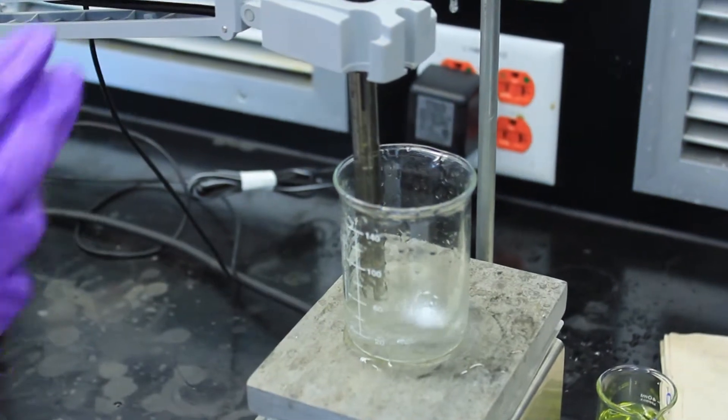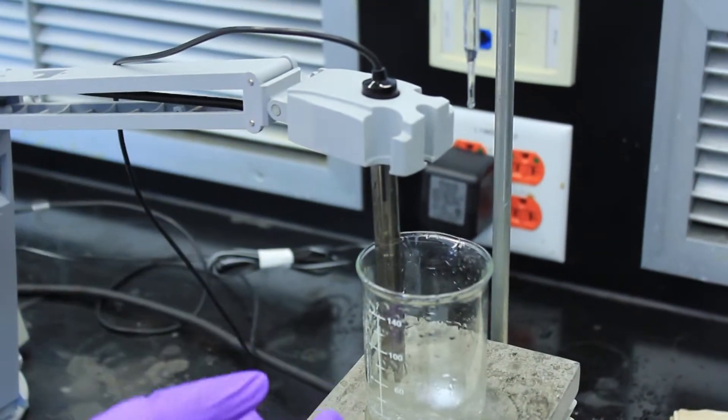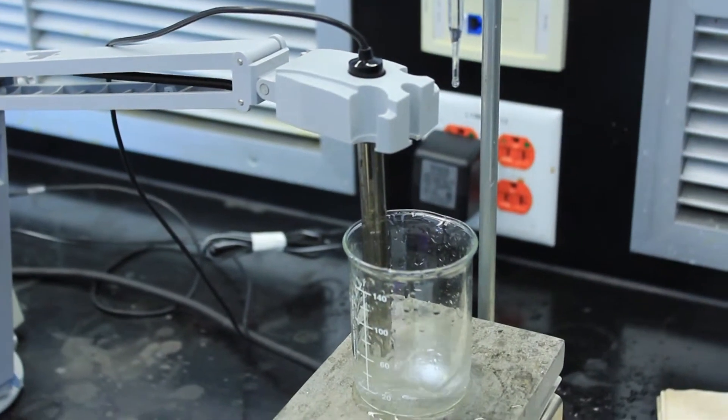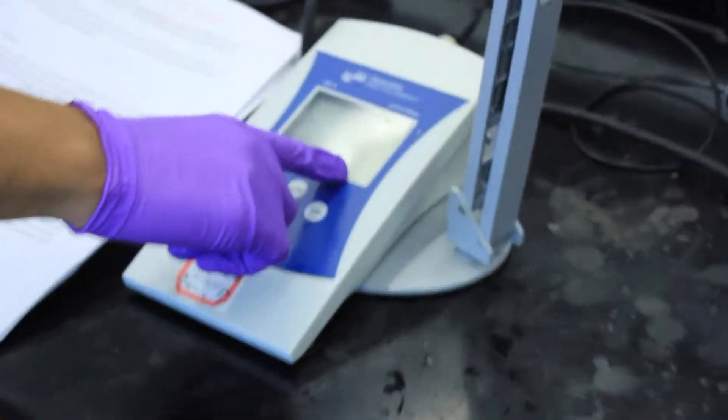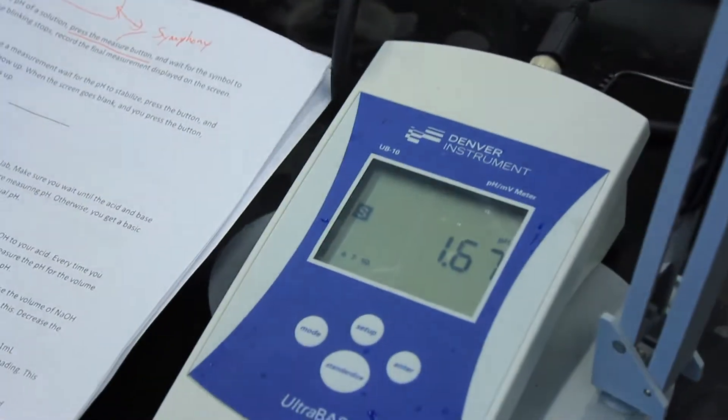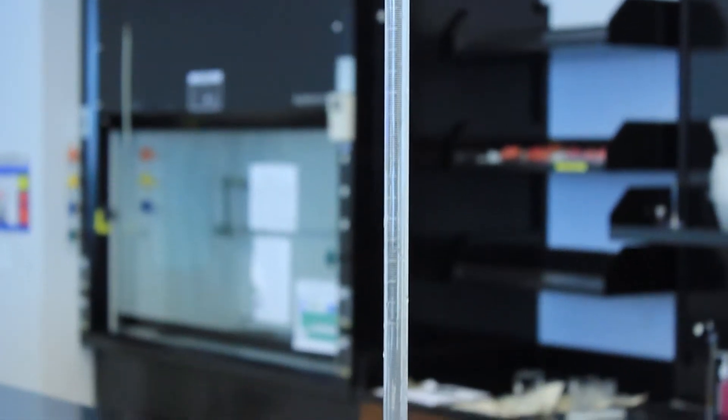Once you add sodium hydroxide to the burette and insert the pH meter into the solution, this is what it should look like. The stir motor should be started. Your pH meter will give you an initial reading. Make sure you record this.